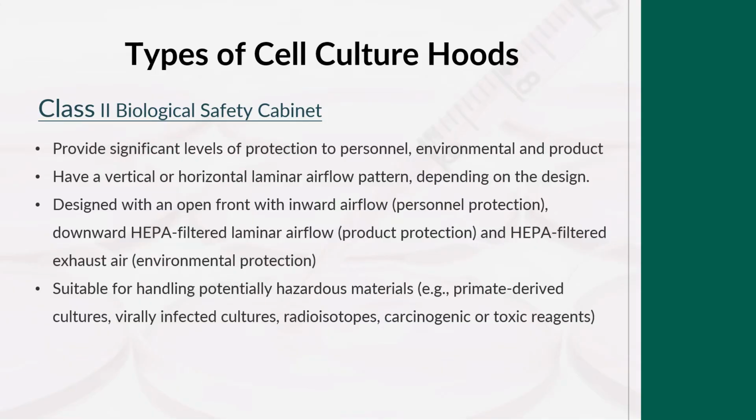They are very suitable for handling potentially hazardous materials such as primate derived cultures or cultures that you have virally infected, or radioisotopes, carcinogenic cells, or even toxic reagents.